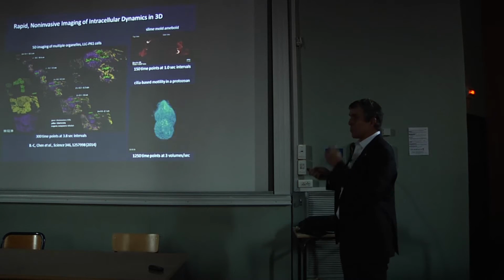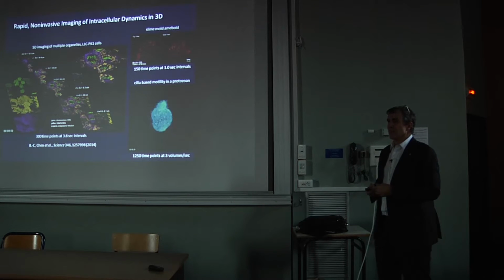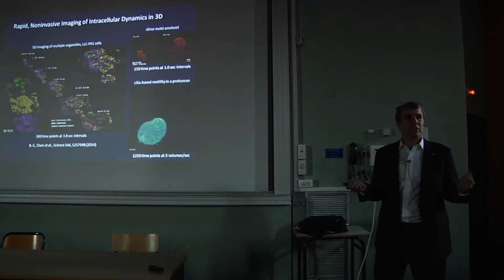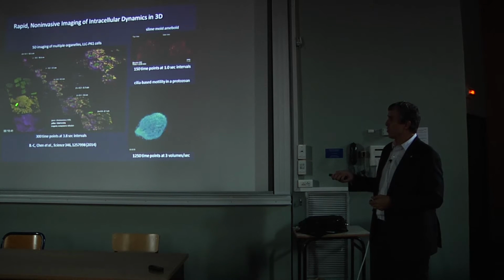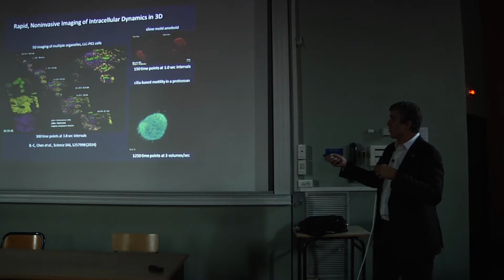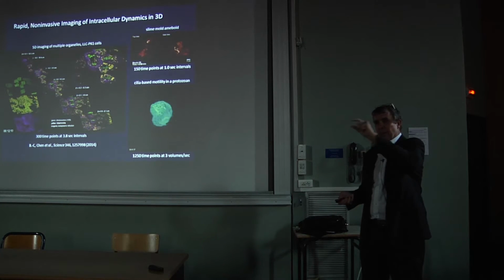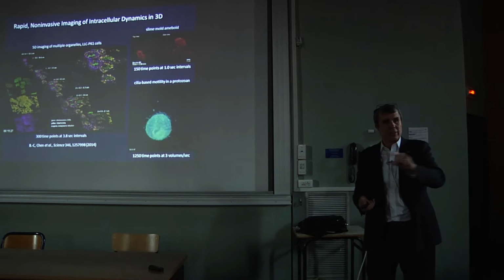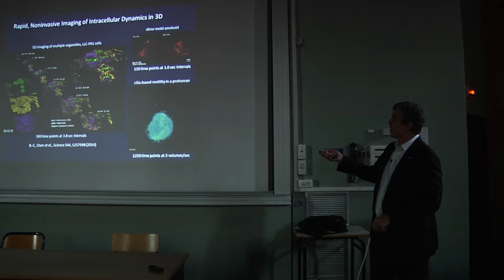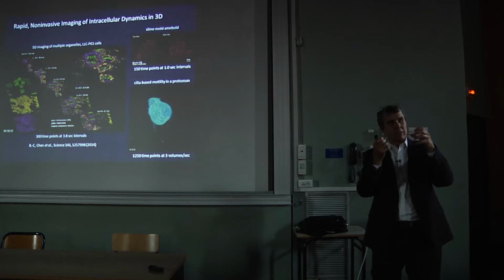So these are some examples of using that for fast 3D cellular imaging. In the first case, we're looking at a field of dividing cells. And we're looking at it in 3 different colors at the same time. One to look at chromosomes, one to look at mitochondria, and one to look at the endoplasmic reticulum. What we're doing here is we're taking that 4D data set and we're slicing it in Z slabs about 2 microns thick each so we can see what's happening on the inside as the cells divide. Here's one such section. And you can see what happens as the endoplasmic reticulum folds up into these little pockets.